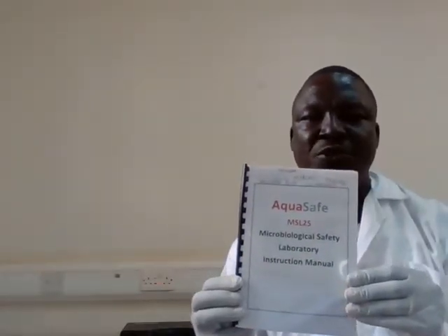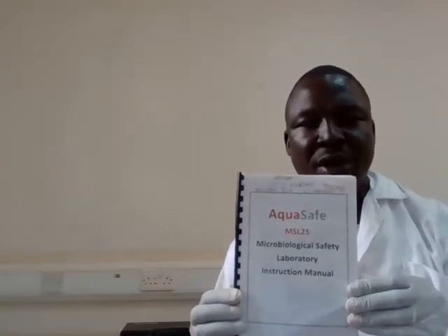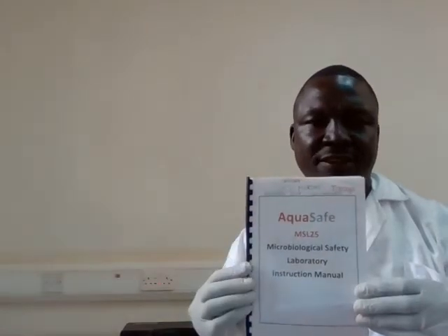Now, for every equipment, there are standard operating procedures or the manufacturer's instructions. They give you the manual that you have to read through before use. So it is very important for you to read this manual inside, all the procedures and all the precautions they are going to give you. So it is very important for you to read the manufacturers' and standard operating procedures.